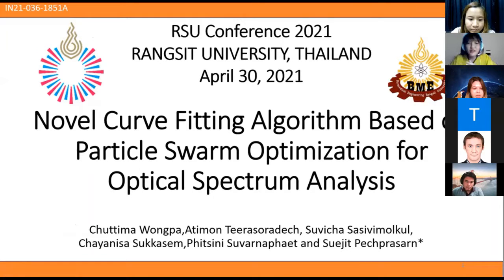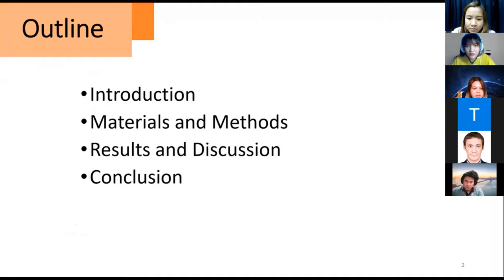Good afternoon, audience. Today, I would like to talk about a novel curve fitting algorithm based on particle swarm optimization for optical spectrum analysis. This is the outline of today's talk. First, the introduction and purpose of this research. Second, materials and methods. Third, results and discussion, and finally, conclusion.